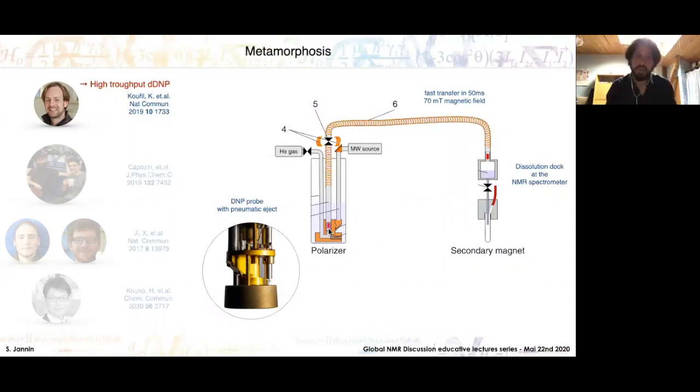And so this is really a game changer, because it really simplifies a lot the way you eject and you dissolve your sample. And it's all new. I think this has really the potential to change the practice of dissolution DNP, especially for NMR spectroscopy. So I'm really looking forward to what Benno is going to come up with in the next years.